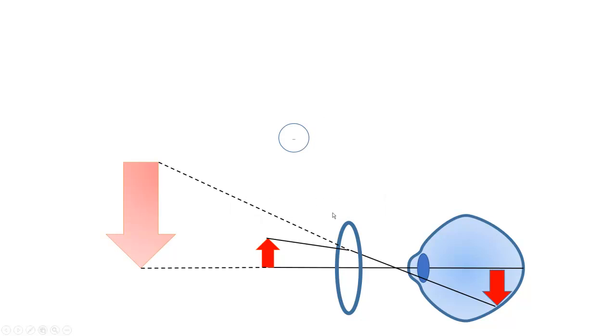In our last video, we learned about magnification and how we can use lenses to bend light rays to help make objects appear larger, right? We form a virtual image, we get a bigger projection on our retina, and we get a bigger picture, okay? But magnification by itself is not enough for us to be able to observe the very fine details of these very small things we're going to be looking at in histology. Magnification alone will not do it.